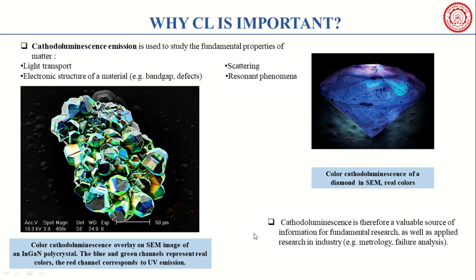Now CL also proves to be a very good technique in industry, and it also provides a very valuable source of information for fundamental research, that is metrology and failure analysis of any industrial goods or products.